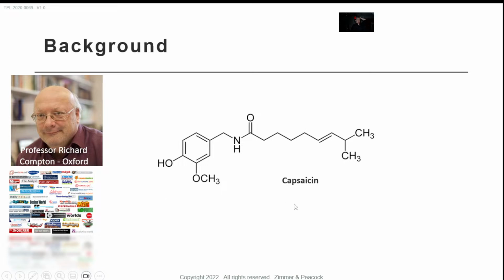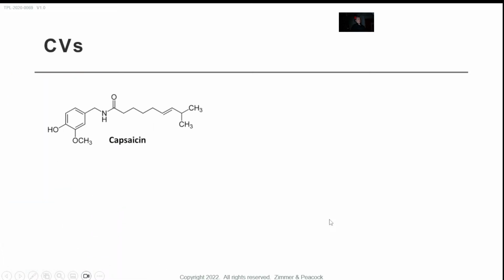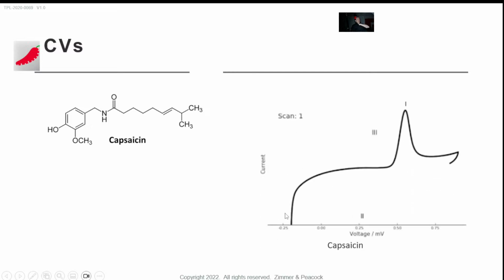I think he's at St John's College in Oxford, and he came up with a method for analysing capsaicin. So both HPLC and FoodSense Gen 4, in the end, are both trying to get to the capsaicin concentration. The only reason I bring this technique up, this is a voltammetry technique, is because you'll see a lot of voltammetry today. Now, the user experience is you put the sample on the sensor, you'll actually get a Scoville Heat Unit. But understand that there's a higher level of transparency in the food sensor.